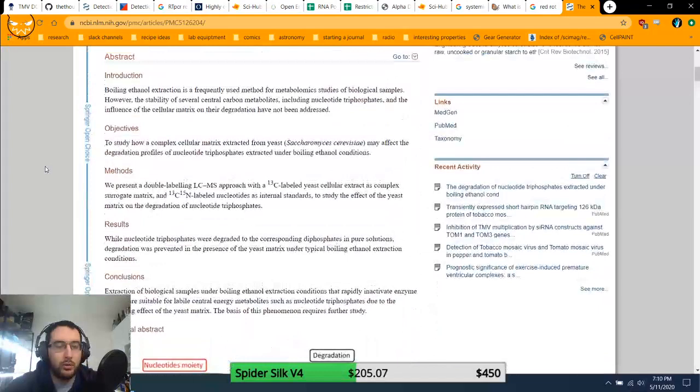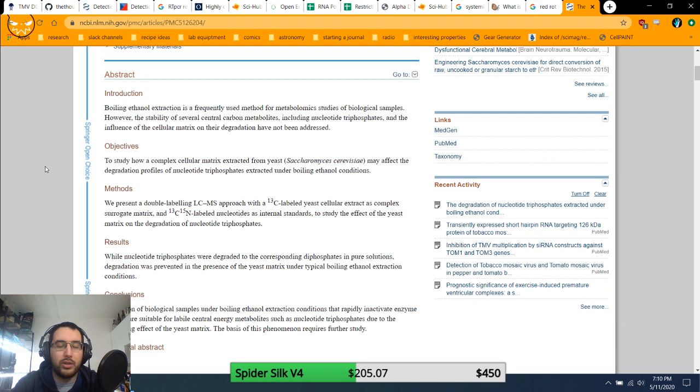So new plan. Extract number 1 is going to be my T7 extract. Extract number 2, I'm going to just grow normal bacteria, a bunch of them, lyse them open, filter it out, bing, bang, boom, I have my NTPs. It's not going to be as much. It's definitely going to mess with my yield, but whatever, it should still work.